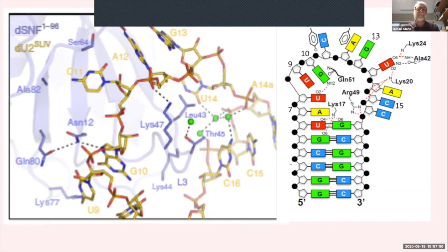We've measured binding by a couple of different ways. One is by ITC, so we know the enthalpies. They tend to be large. There's also a huge coupling constant related to these. The thermodynamics is very complicated because the residues on the surface of the protein are coupled to each other.